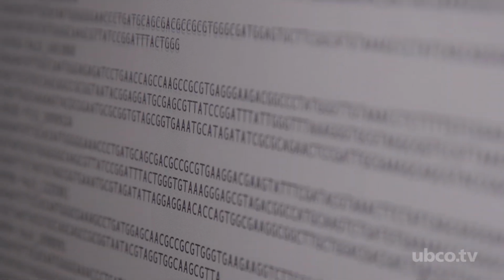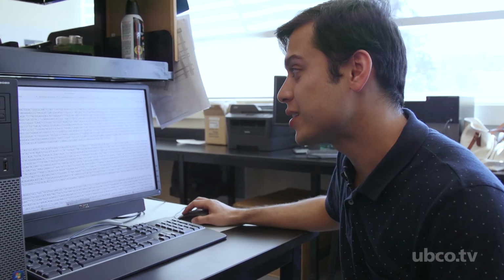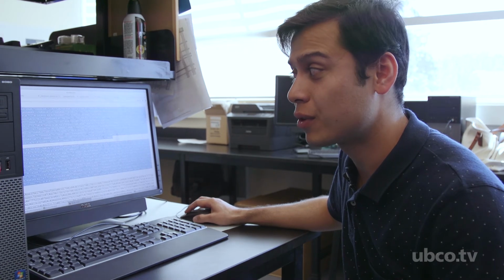Hi, my name is Nijat. I'm doing the bioinformatics analysis for this whole process. So after the sequencing is done by the company, they send us the data and I start analyzing it. So this is the whole raw data, what it looks like.